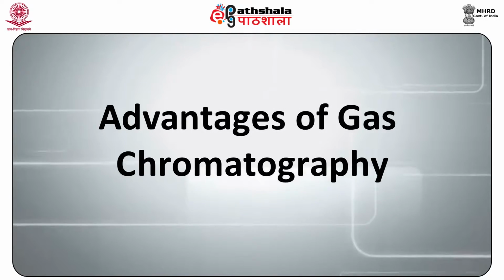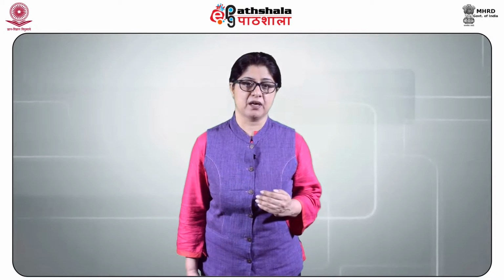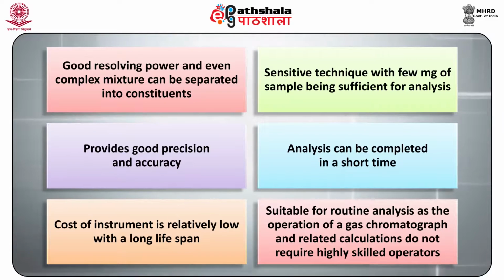Advantages of gas chromatography. The main advantages of gas chromatography are: the technique has good resolving power and even complex mixtures can be separated into constituents. It is a sensitive technique with a few milligrams of sample being sufficient for analysis. It provides good precision and accuracy. The analysis can be completed in a very short span of time. The cost of the instrument is relatively low with a long lifespan.